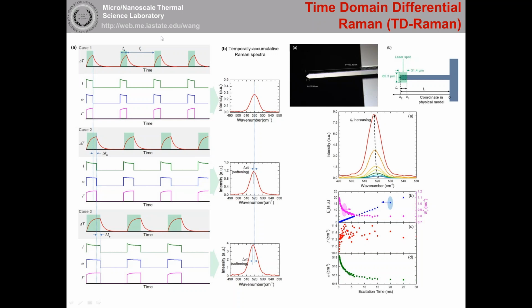So later on, we did some work. Basically, we disassembled the spectroscopy, made some holes, and introduced a second laser to the system. It's very time-consuming, but we did it. With this laser, we can do modulation. You see this green one? That's the laser.